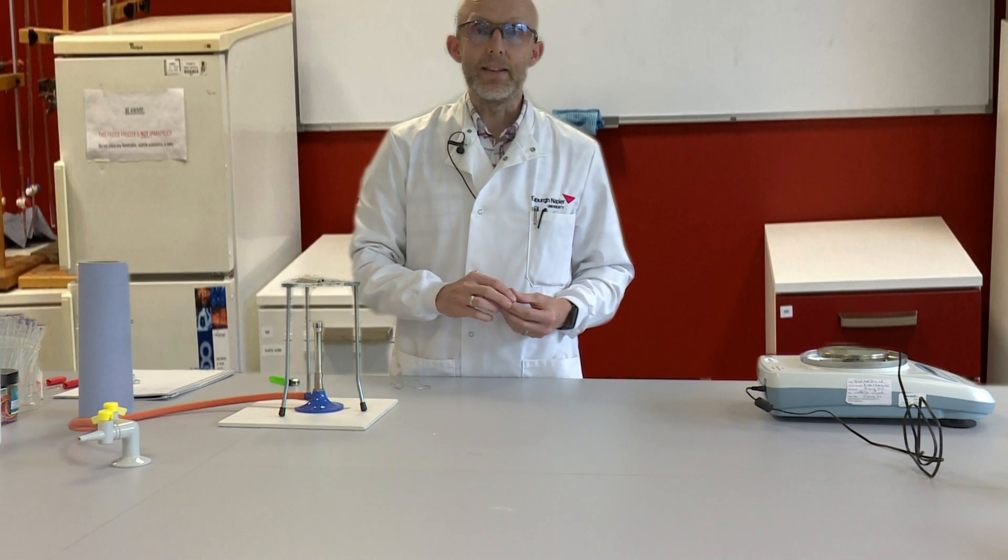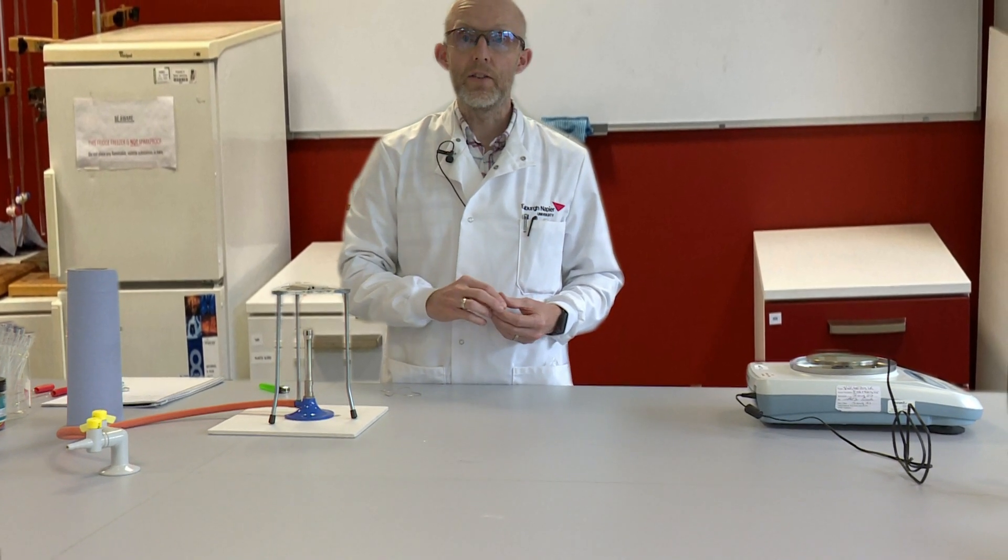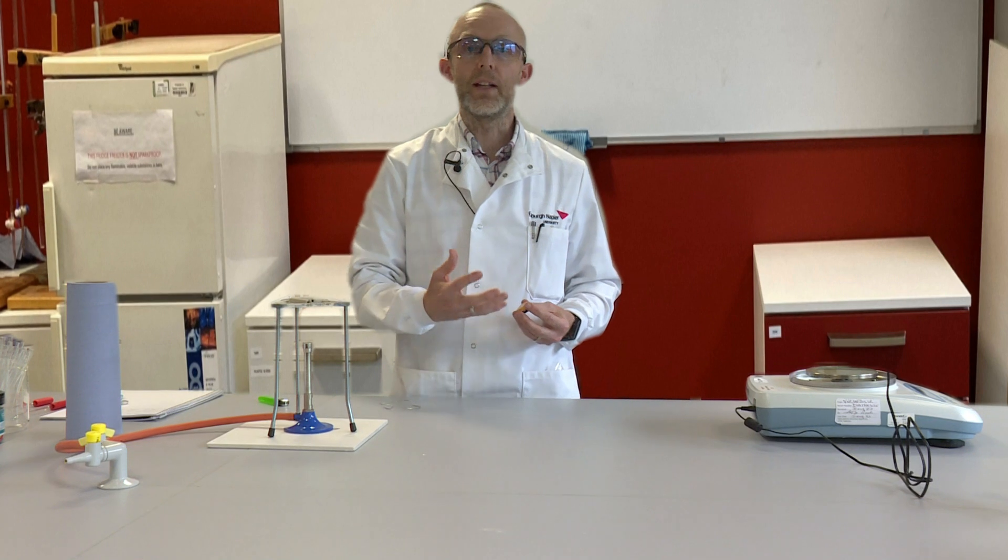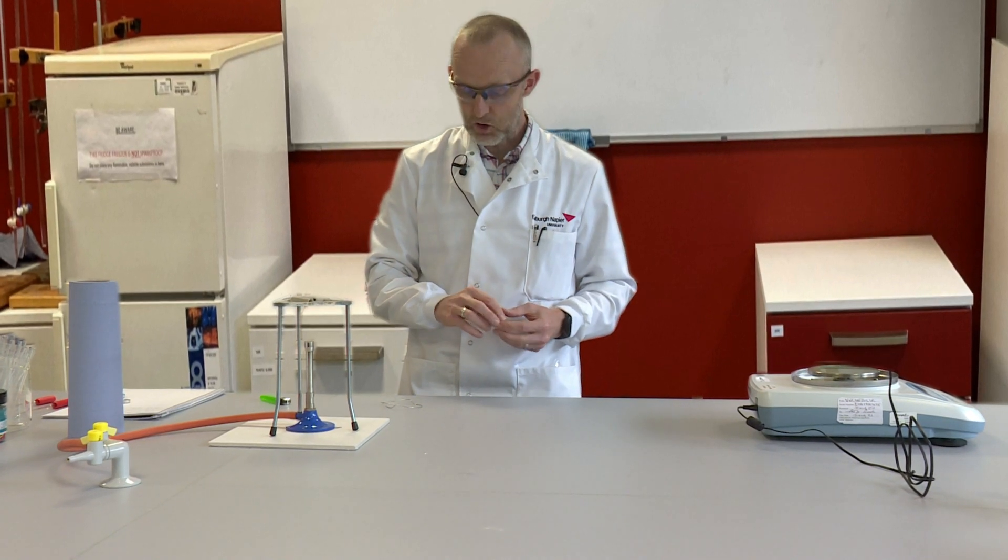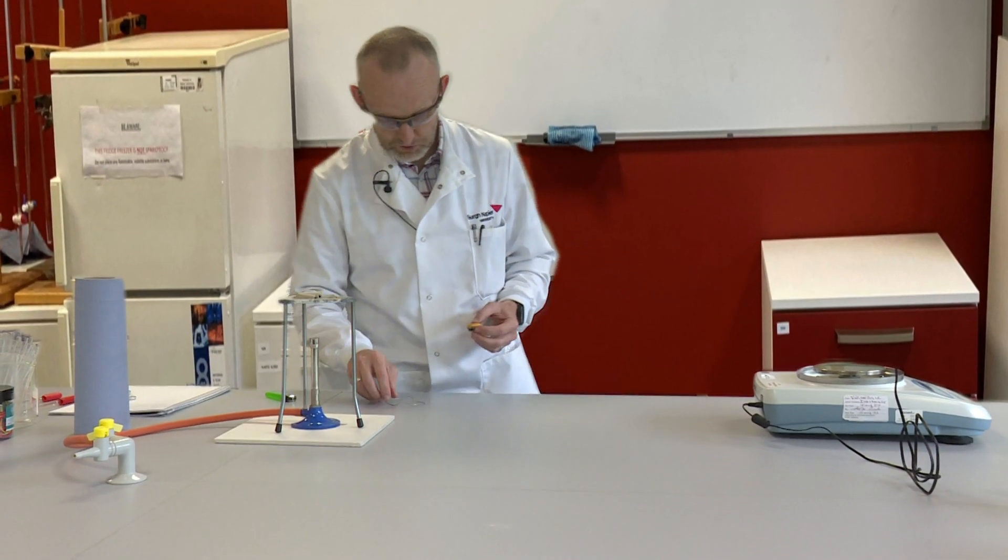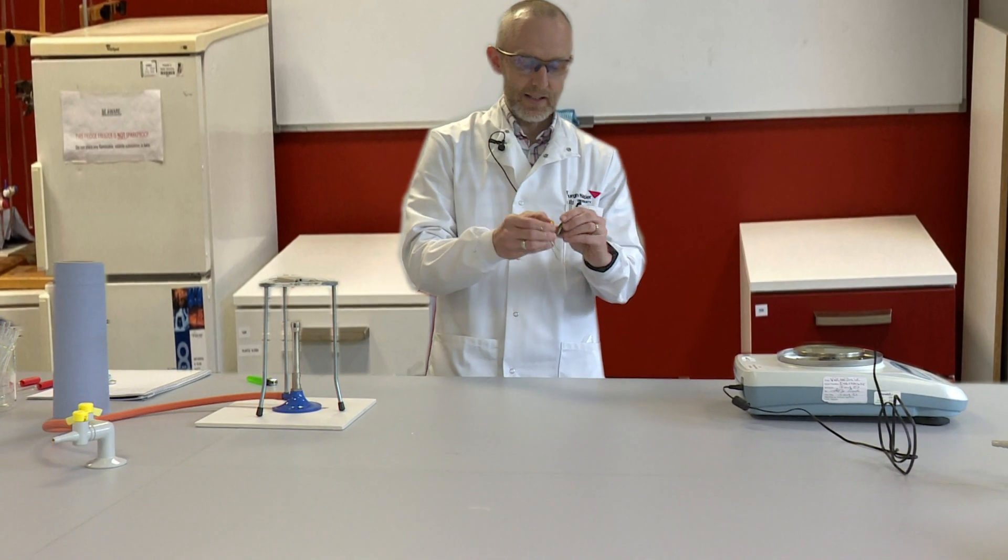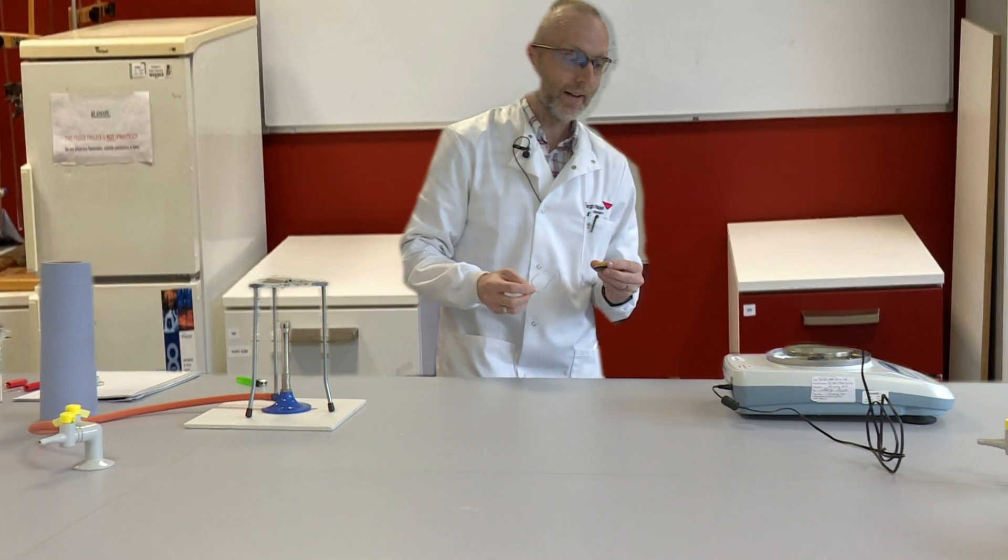And then by taking the mass of the magnesium that we start with and the magnesium oxide that we form, we'll be able to calculate the formula of magnesium oxide.